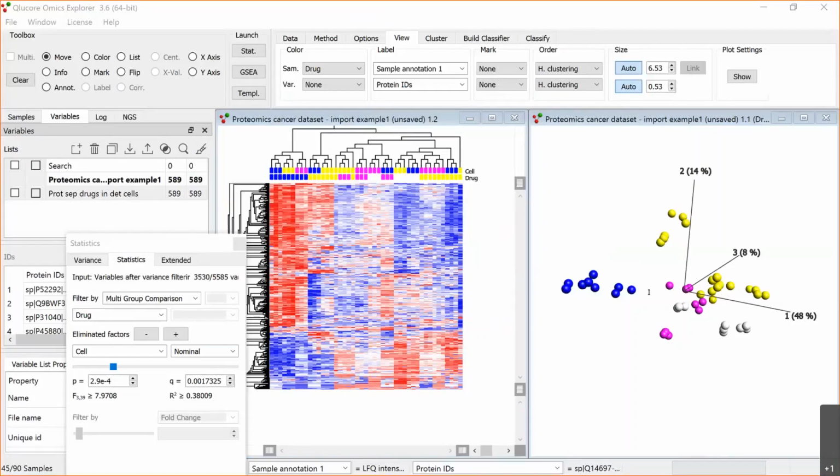Data is normally uploaded in a number of different file formats. So this specific data set has also been pre-formatted by one of our experts before it came into TXT. So it's a wide variety, unfortunately, on uploaded public data. But if you are lucky, you might well find it in TXT format or Excel. Excel is easy because then you can just save it as a TXT file.